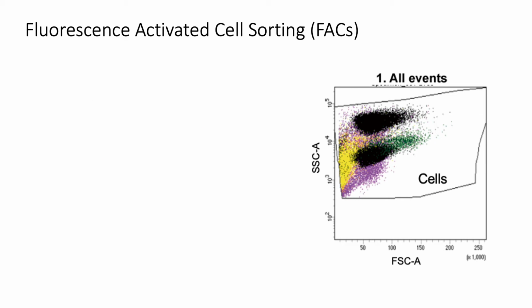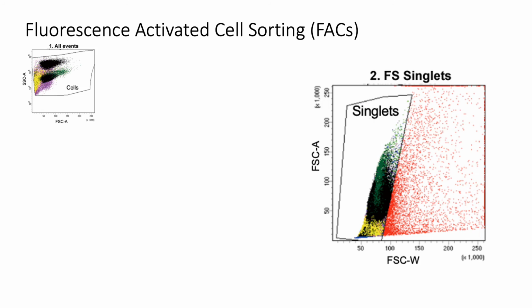Fluorescent activated cell sorting provides a means to determine the cellular admixture with fluorescent conjugated antibodies. We use the following gating strategies to sort. Each gate is first shown enlarged on the right and then becomes part of the figure on the left. First, we use forward scatter versus side scatter to represent size. We then select the particles that are large enough to be considered cells. From this population, we distinguish single cells by gating out doublets, which are 2 or more cells that are stuck together.